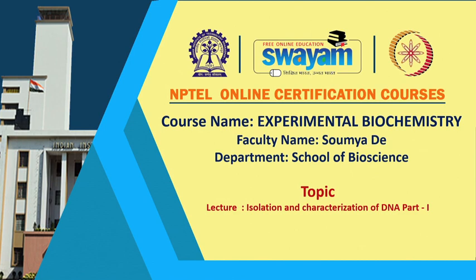Welcome to week 9. In today's lecture, we are going to talk about isolation and characterization of DNA. In a previous lecture, in week 7, we talked about isolation and characterization of proteins. And today we are going to look at isolation and characterization of another biological macromolecule, which is DNA.